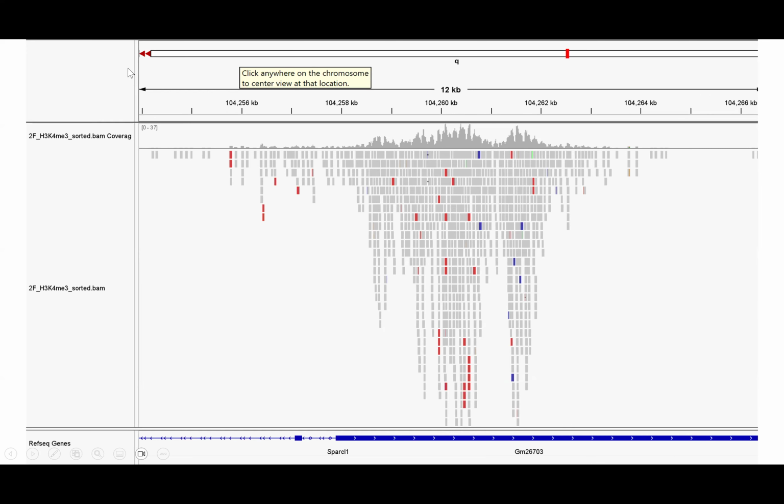Cut it off of my screenshot, but up in the top corner, there is a selection for what genome you used for the alignment. Once you select that, when you drag and drop the sequences, it will know where you're at.